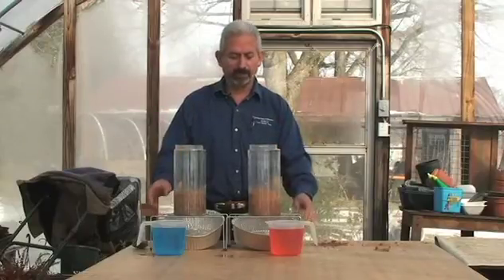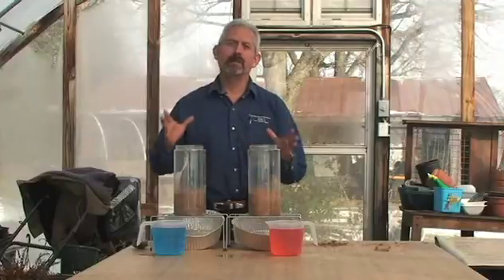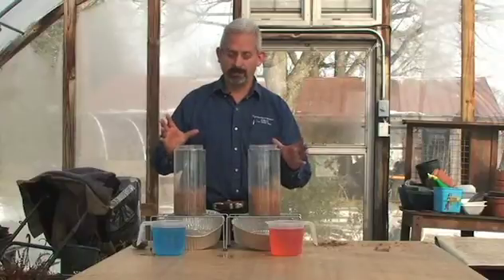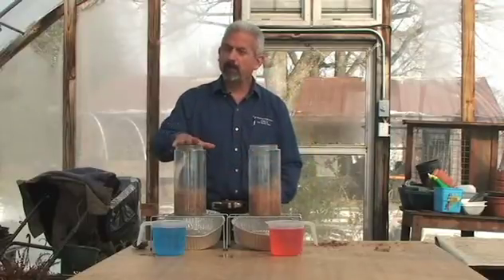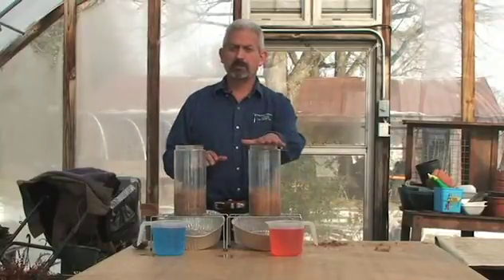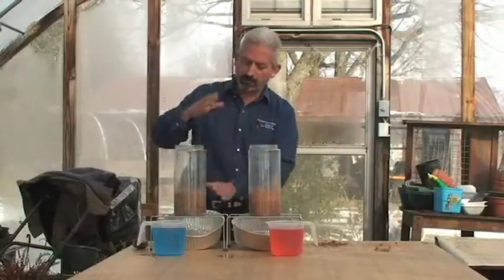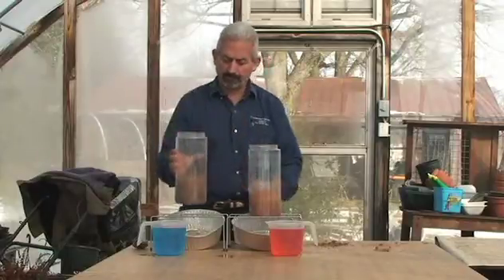This test is called the miniature rain simulator, used to build upon the point of the Slake Test — the two tests are very related. When you have no pore space, you have no infiltration. I collected soil from a conventional till agro-system and a no-till agro-system. This no-till soil has not been tilled in 40 years; the other has been continuously tilled every year to grow vegetables. Same soil types. The plastic jars are filled up a quarter of the way on both.